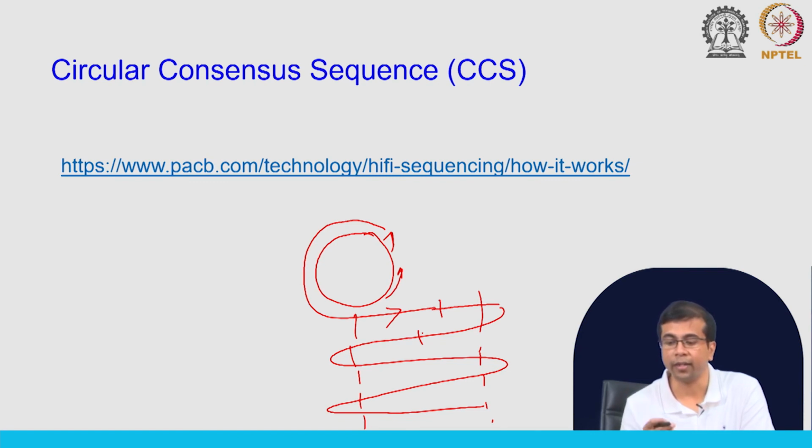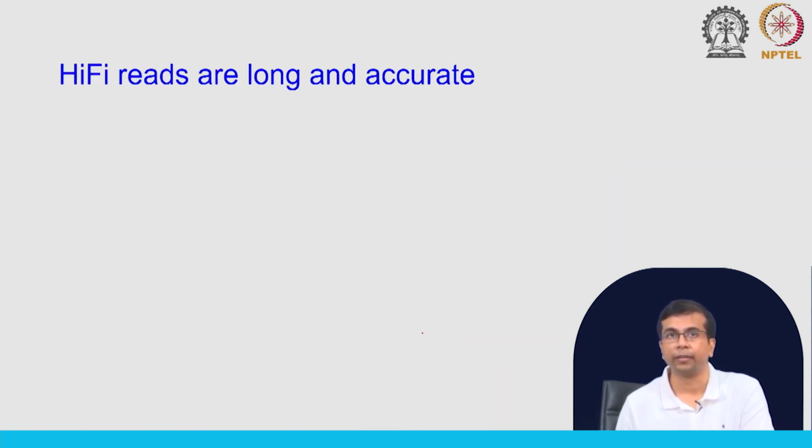Okay. Here is a link where you can see how this method works, and you will get a better idea of it through the animation. And the advantage is that hi-fi reads are both long and accurate.